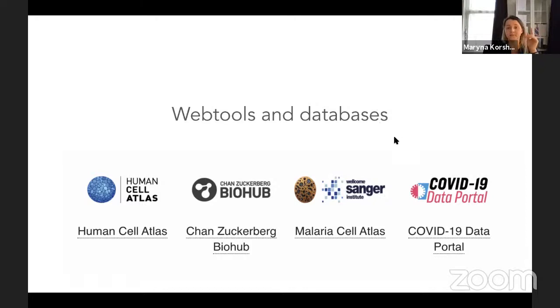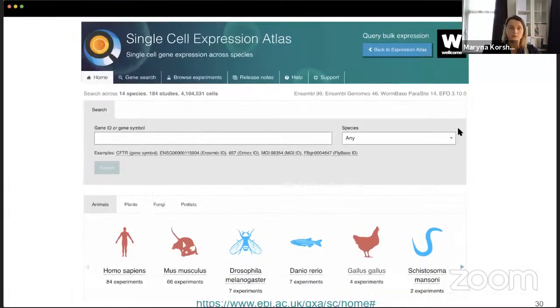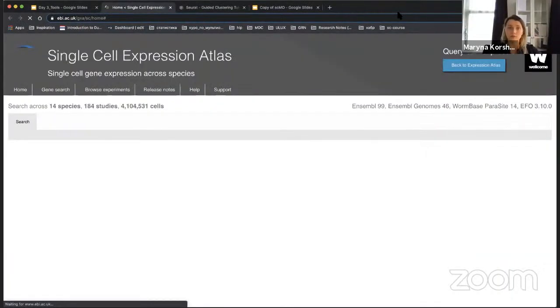Yeah, and also the Mouse Cell Atlas, but the list of these hubs and databases is increasing. So the one positive moment, what you have to know about these resources, is that they have information about the publication, about the data set, related information like metadata, and the results that were received after processing of this data set. So it's actually very convenient. But some advanced options may allow you to also do discovery of your single cell objects or already published single cell objects using a web interface.